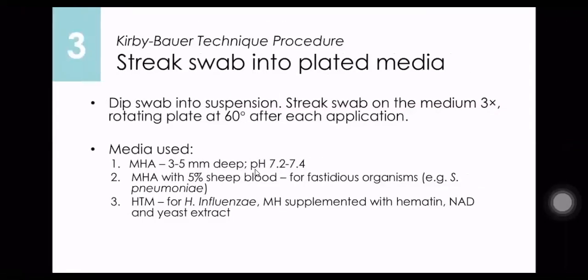Okay, next is streak the swab into the plated media. So first, we dip the sterile swab or cotton swab into the suspension, and then streak the swab onto the medium 3 times by rotating the plate at 60 degrees after each application.